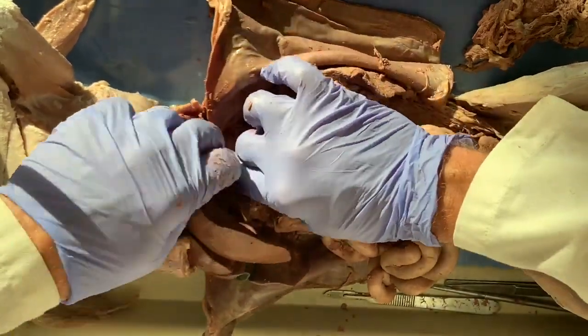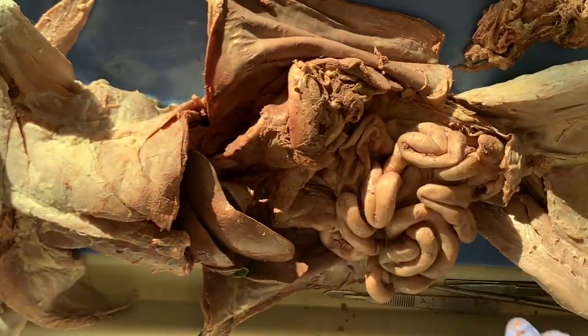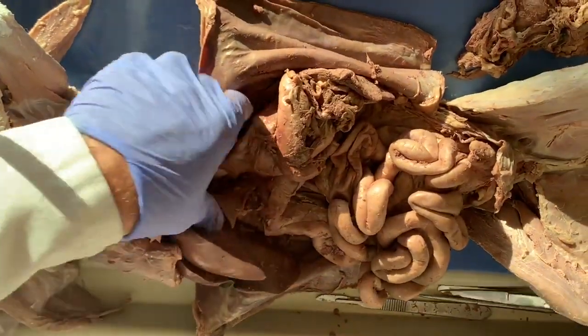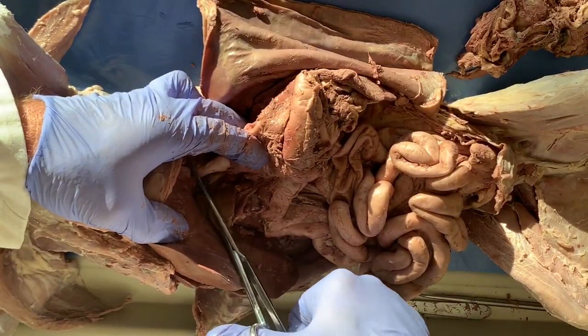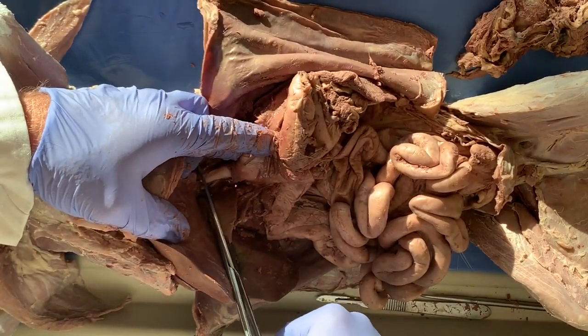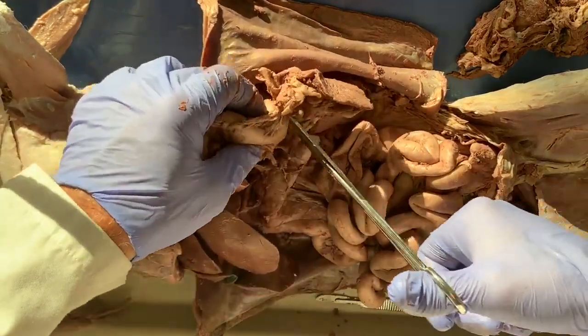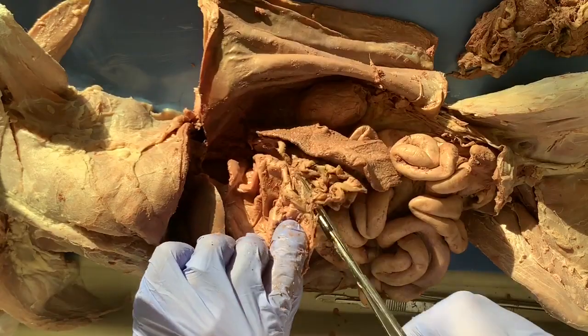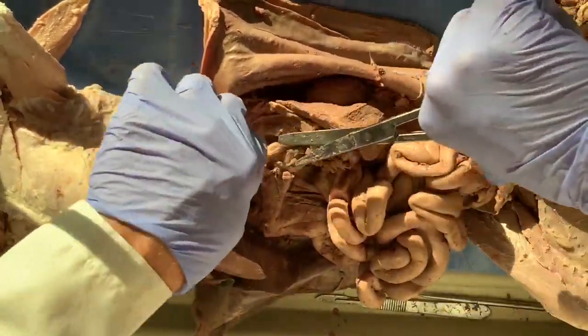And now I can kind of see right here. And then I want to pull it down and then snip the top of the esophagus. Okay, there it is coming into the stomach. It's about as high up as I'm going to be able to get it. Okay, and then I just have to disconnect it from the omentum and the other connective tissues.